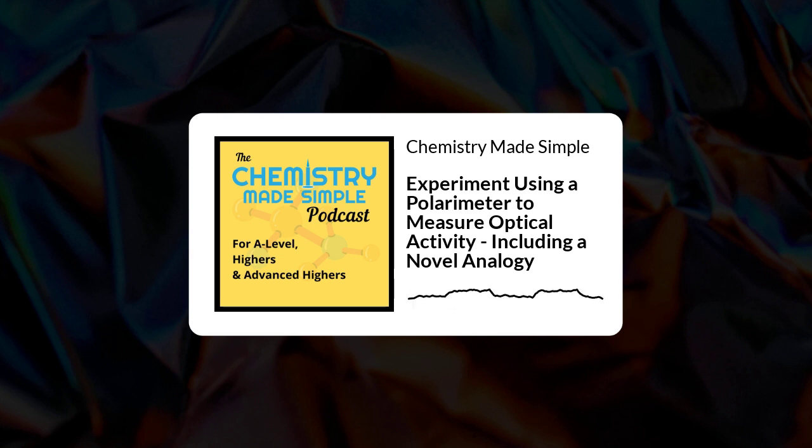And that straight road represents that direction they're going along, and the roundabout, the traffic circle, represents the sample in the sample cell. The different directions that the bus could take represent the different things that might occur to the light that is passing through the sample. So if the bus was to go straight on, that represents that the sample is not optically active. It's not a pure enantiomer. It may be a compound that doesn't even have optical activity at all. If the bus turned left or turned right, that would identify the sample was optically active. There is one enantiomer or another enantiomer of whatever the sample compound is.